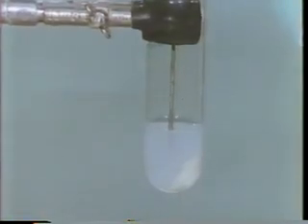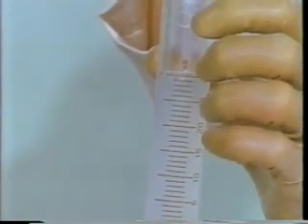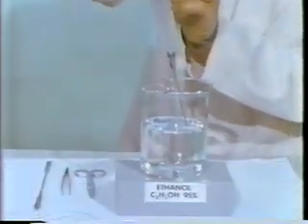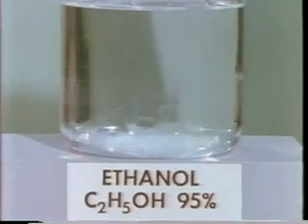The next step is to concentrate the DNA. The liquid is drawn off and injected into alcohol, which precipitates the DNA.